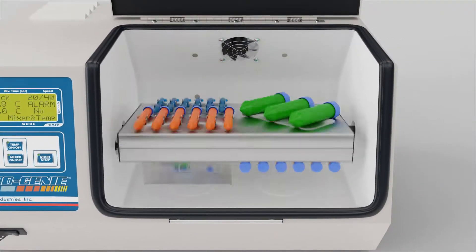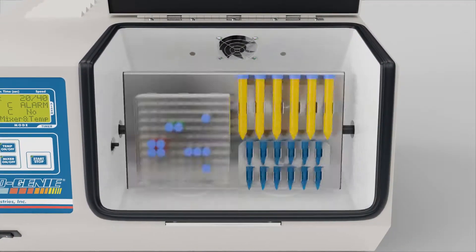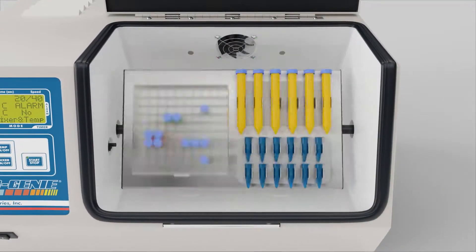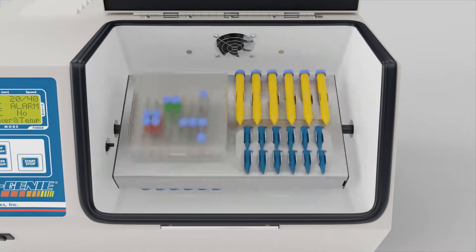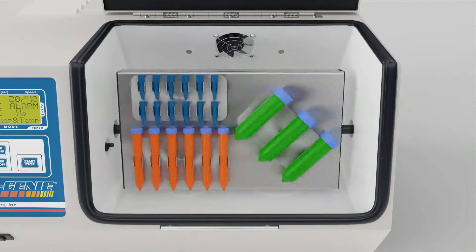Equipped with unique magnetic clip plate platforms to securely hold almost any vessel in any orientation.